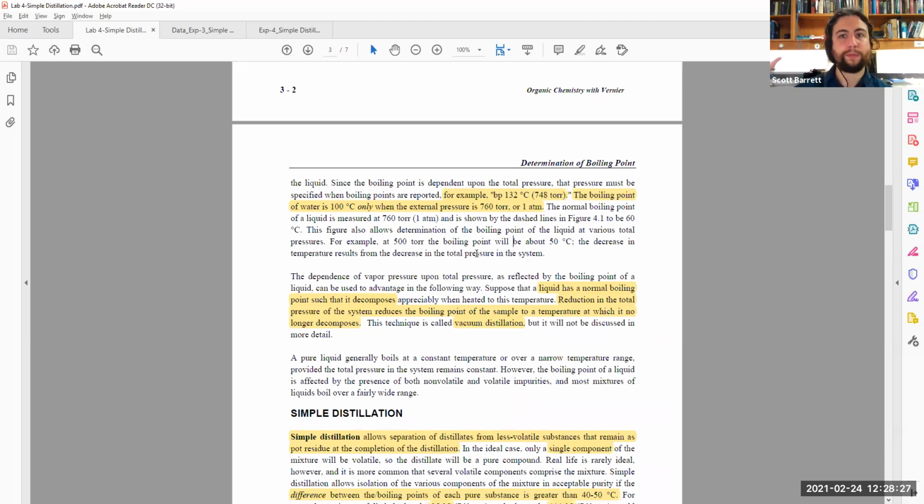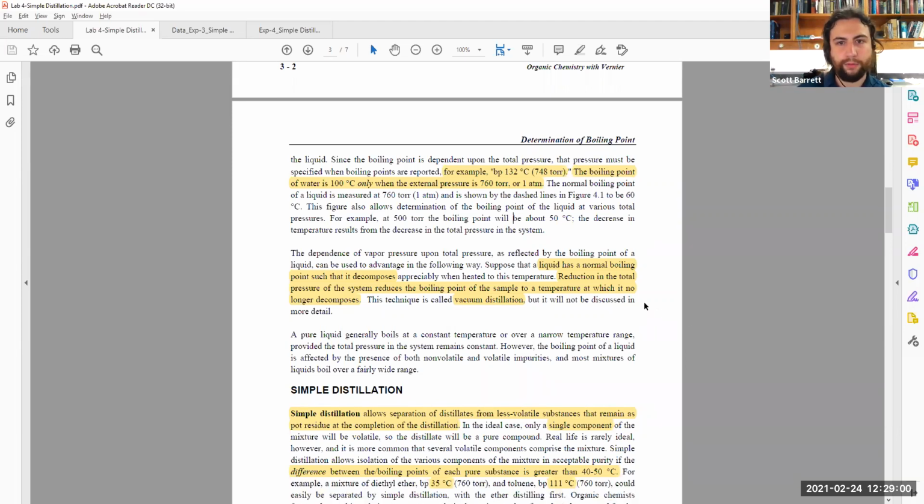And also you don't have to add as much temperature into the system. So not only does it create a harm reduction system for you, where you have less temperature needed to put into the system, but also you can just reduce that pressure, and then you will perform it faster and easier. It's a very good thing to utilize in lab for things that have very high boiling points or can decompose at very low temperatures. You can just reduce the pressure of the system and then boil it at a lower temperature. And it was super useful.